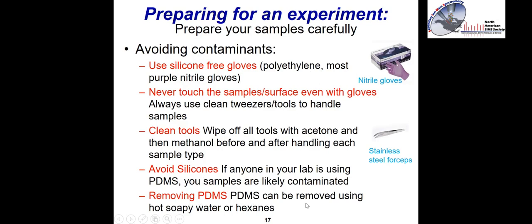And PDMS, once you have it, it can be removed with hot soapy water or hexane. Other solvents really won't touch it. But obviously these cleaning methods aren't great for most sample types, so it's best just to avoid it.